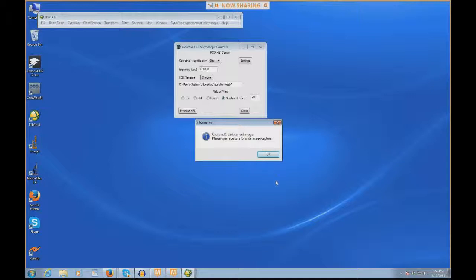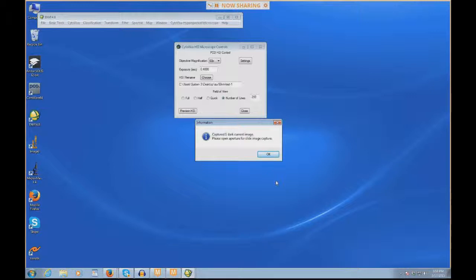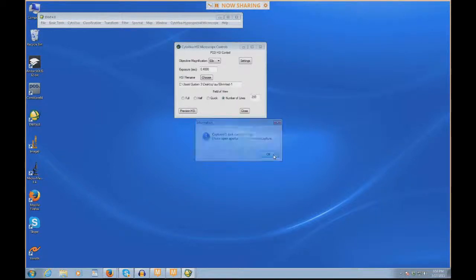It says captured one dark current image. Please open aperture for slide image capture. What this means is when you hit OK, the scan is going to start. Before you hit OK, you want to pull this slide bar in the trinocular piece all the way out. So now all of the light will be routed back to the spectrograph. I always use this opportunity before I hit OK to look into the microscope and make sure everything is in focus one last time because you don't want to wait maybe five or ten minutes if it's a long scan and find out that the image was out of focus. Everything seems to be in focus still, so I'm going to pull the slide bar all the way out and hit OK.